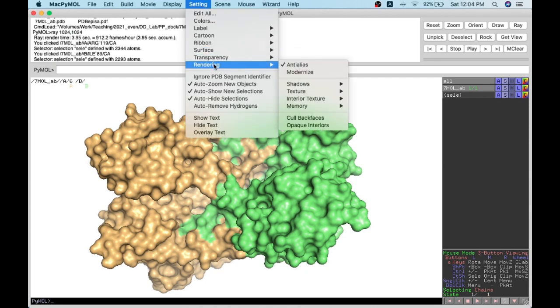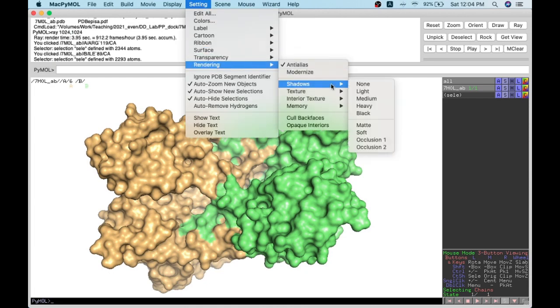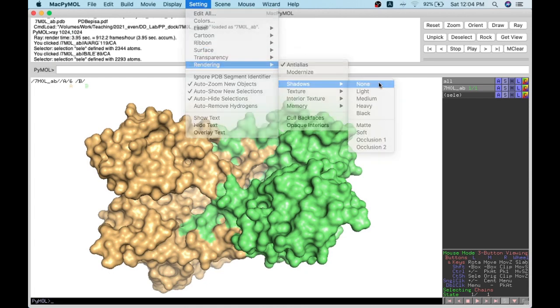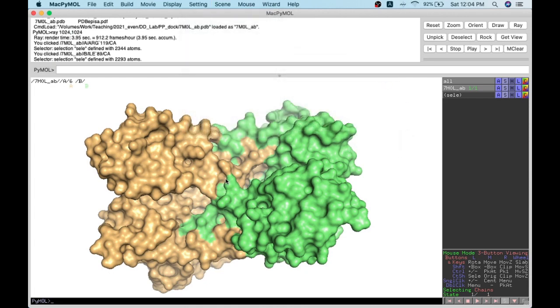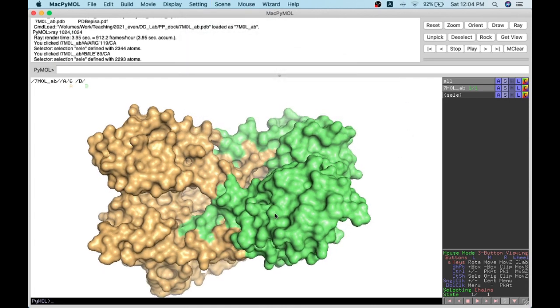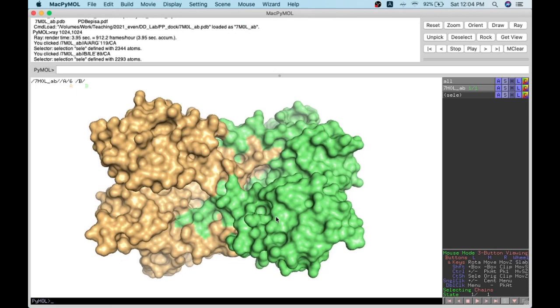I hide the shadows — I don't want shadows anymore. I can save the image, and I don't want any chain displays showing. I can switch off the chains and do a simple ray rendering.